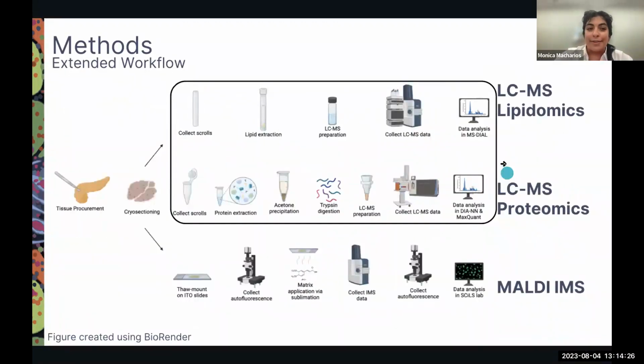Very briefly, LCMS consists of a liquid chromatography instrument, which uses a stationary non-polar phase and mobile polar phase to separate analytes in a sample based off of their hydrophobicity. More hydrophilic molecules are eluted faster into a mass spectrometer, which further separates these molecules based off of weight.